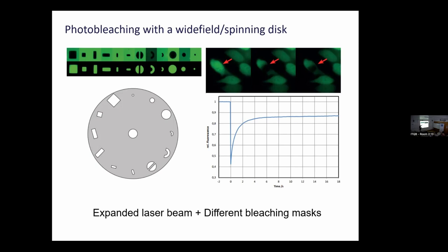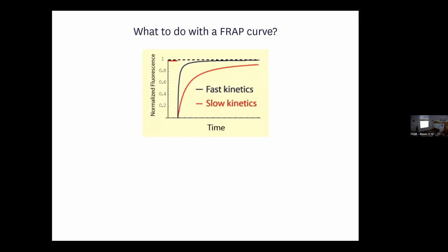You typically have to buy an additional laser and additional optics components, and you can have FRAP modules for wide fields or spinning disks. Right, coming back to us. So we have a FRAP curve and we have recovery.